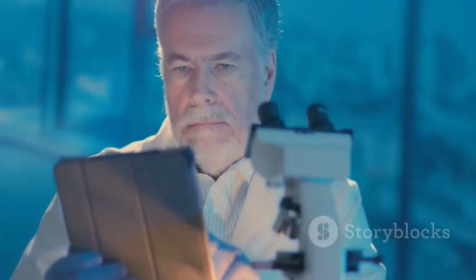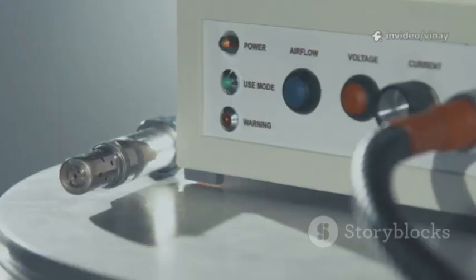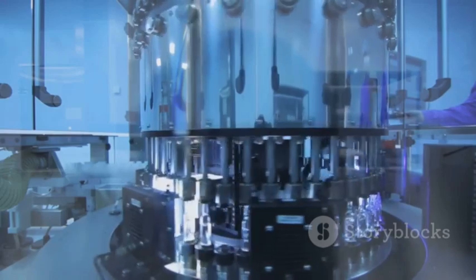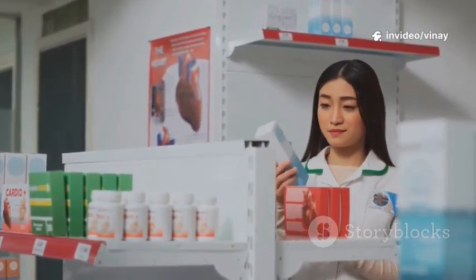So, what happens when a filter integrity test fails? The first and most important rule is to stop and investigate. A failed test is a red flag that just can't be ignored. The immediate consequence is that the filter in question cannot be used, or if it was a post-use test, the batch of medicine that was just filtered is now considered suspect. It cannot be released for patient use until a thorough investigation proves that it is safe.